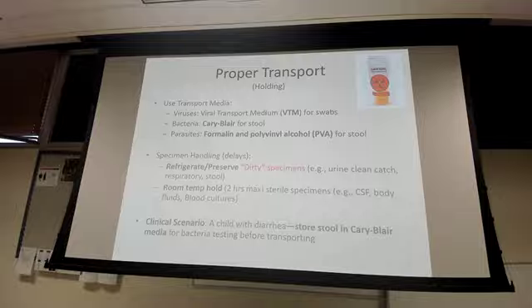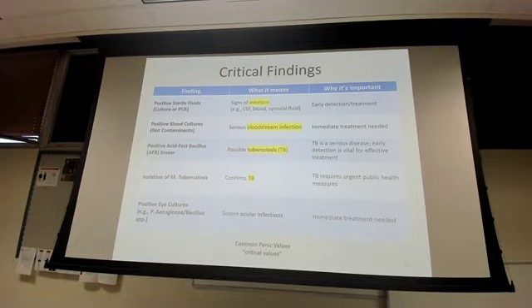Specimen handling delays. If there is a delay, make sure that you're at least placing the specimens in the refrigerator. If you don't have a fridge, make sure that you're holding it to about 2 hours max. If it's anything after that, we may have to reject it. So get it to us as soon as possible.